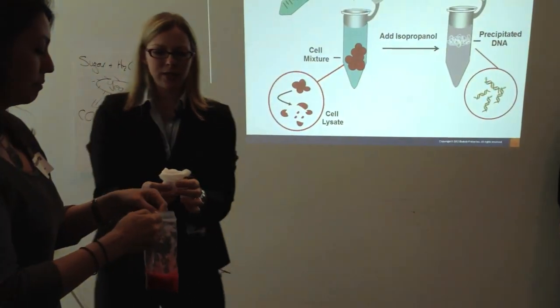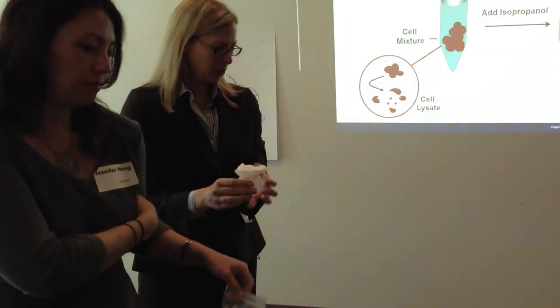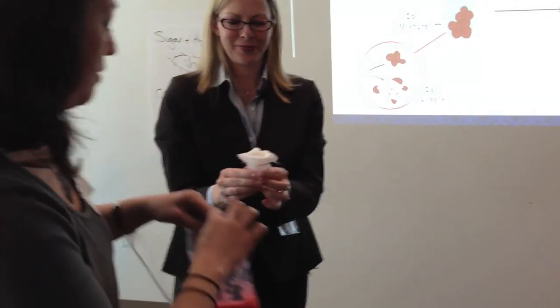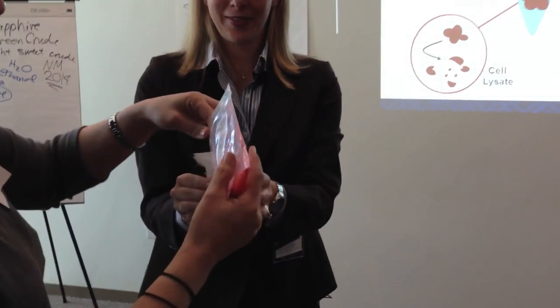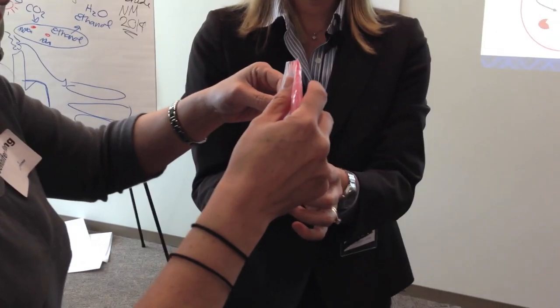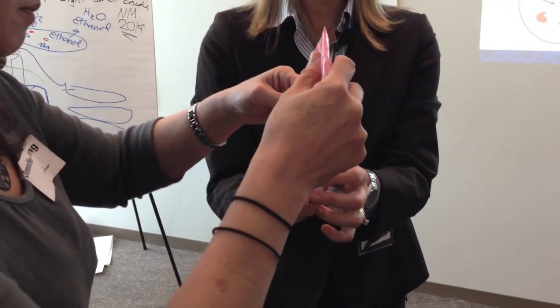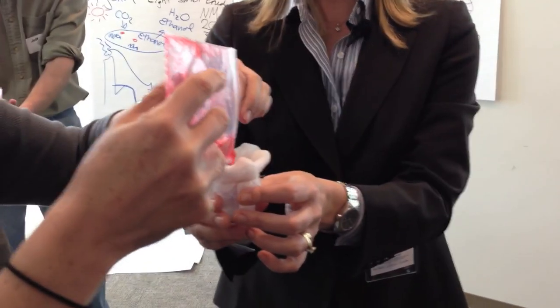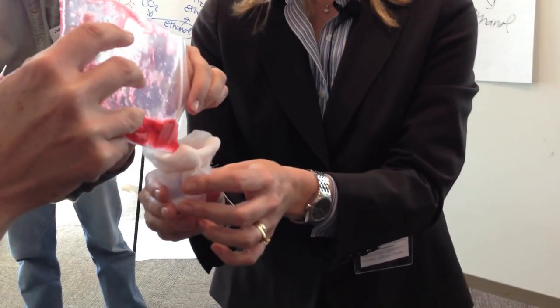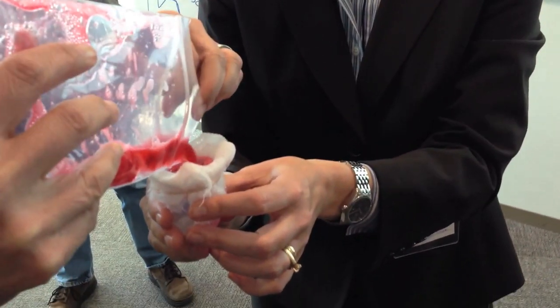Pour it carefully. We don't want to get a whole bunch on the ground. You don't necessarily need to do the whole thing. You want more DNA? Yeah, if you want more DNA.